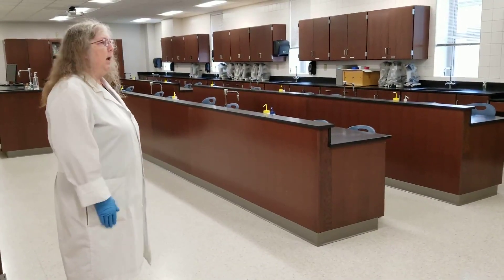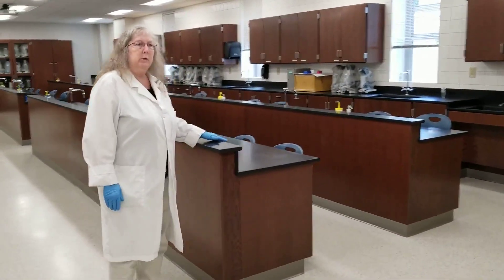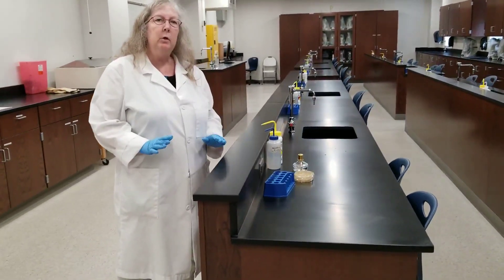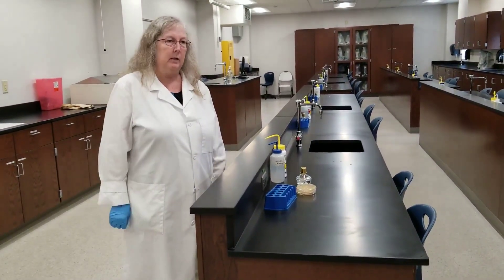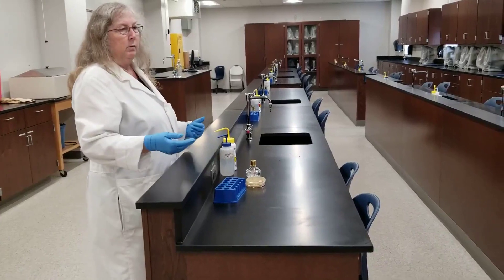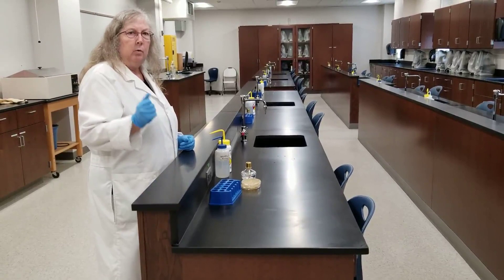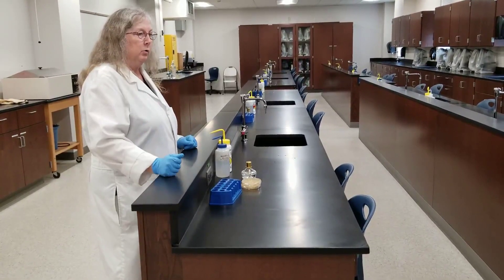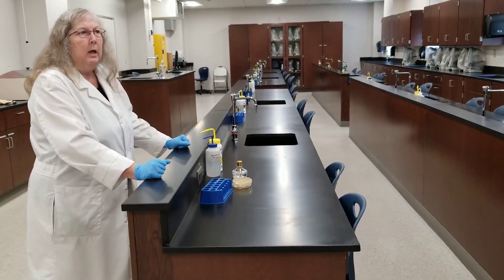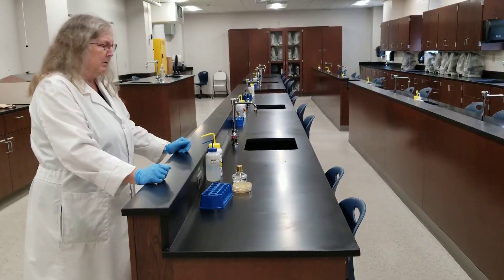Number one: when you walk in the lab, put your things aside. Do not put a lot of clutter on your work area. You want to keep your work area as clean and uncluttered as possible — just what you need for the experiments you're doing that day. Put everything else away. On the working area, you want it to be as clutter-free as possible. That way, it reduces the chance or the risk of knocking things over or accidents happening.